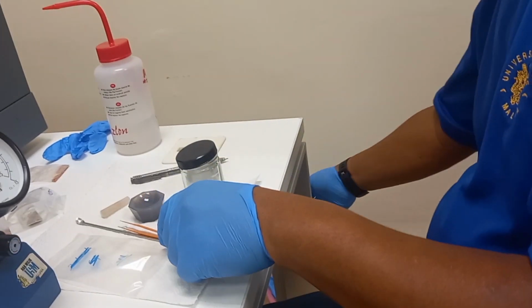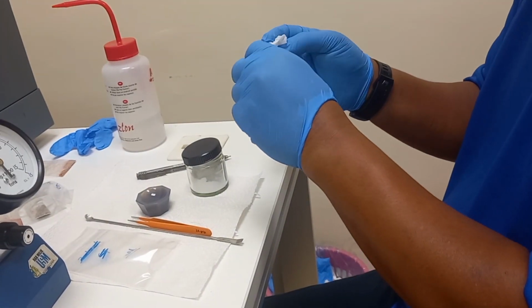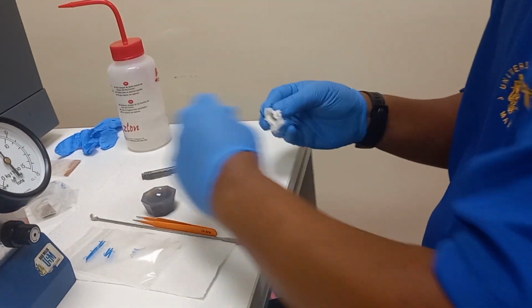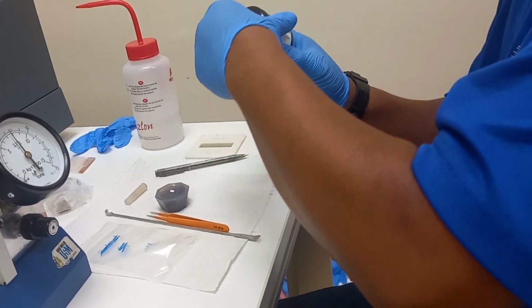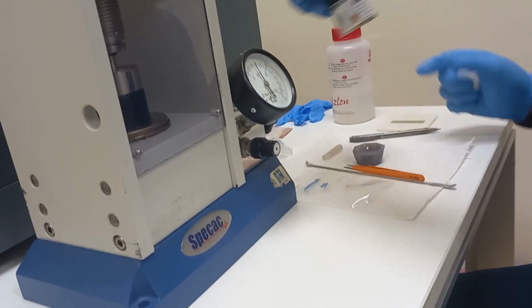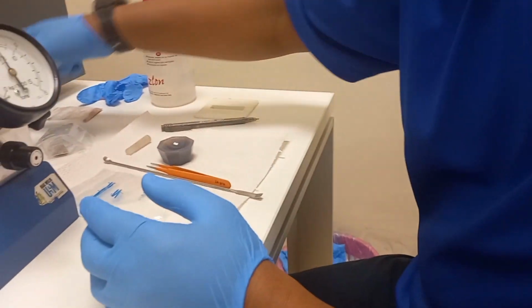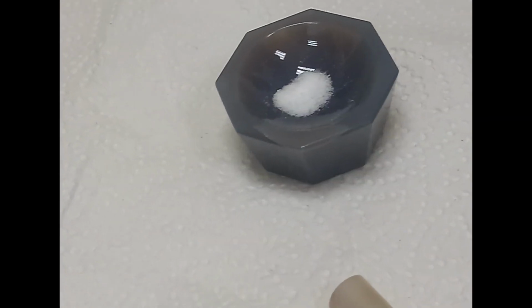This pattern contains information about the differences in the intensities of the sample and the reference beams. The interference pattern is detected by a detector which converts it into an electrical signal. The signal is then processed by a computer to obtain the infrared spectrum of the sample.